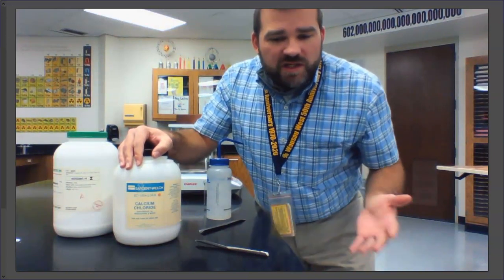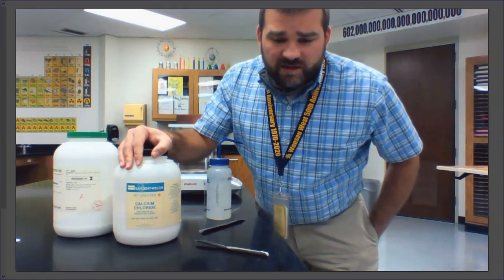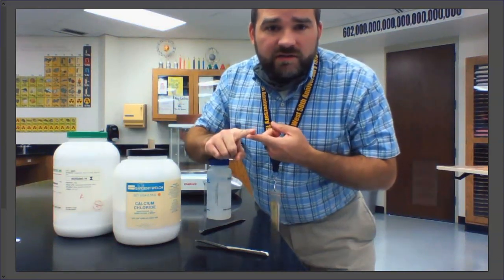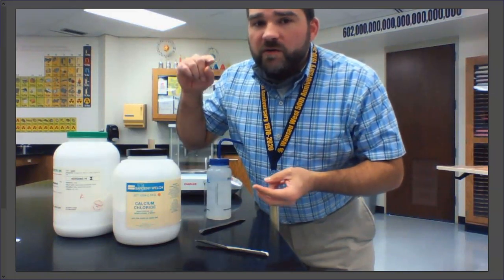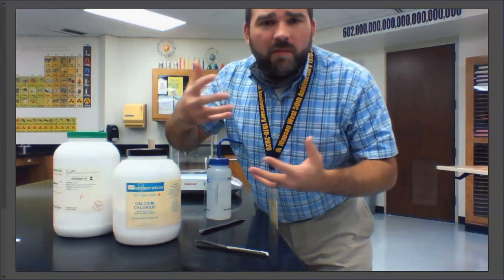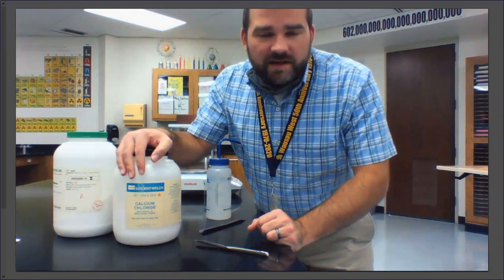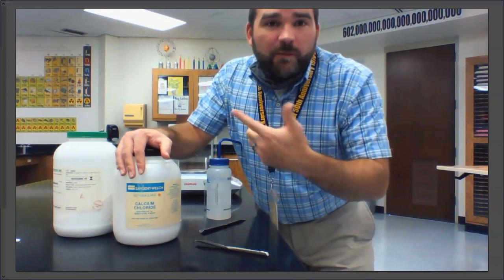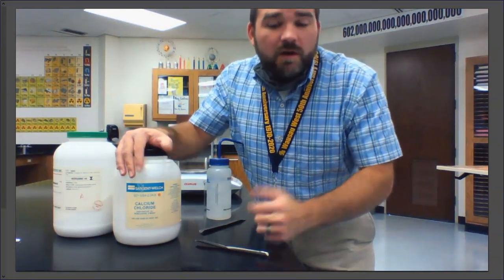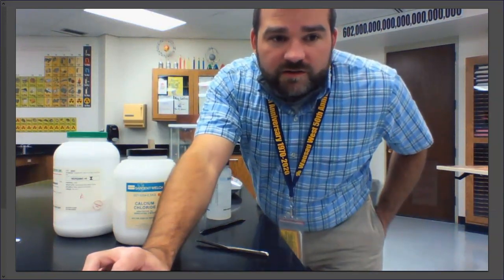So today's lab, which was an introductory lab that we would have done last week, is all about a couple of concepts. We're going to learn about net ionic equations, we're going to learn about precipitation reactions, and we're also going to learn some lab techniques. These are called gravimetric lab techniques, involving gravity. That's things like massing and filtering, and both of those are a part of today's lab. So let me get some things ready, and we'll get started here in just a little bit.